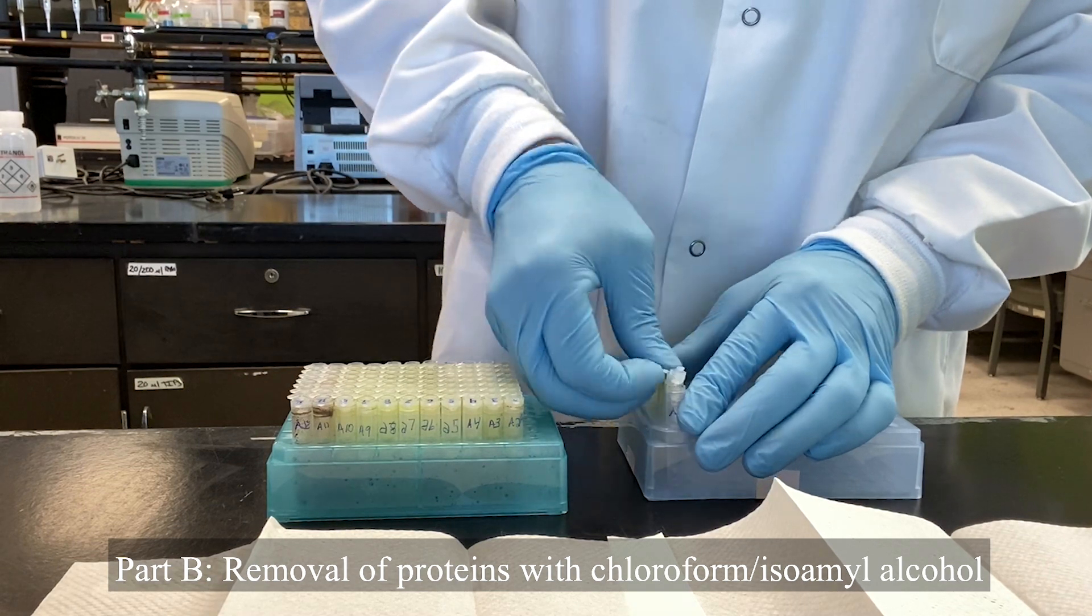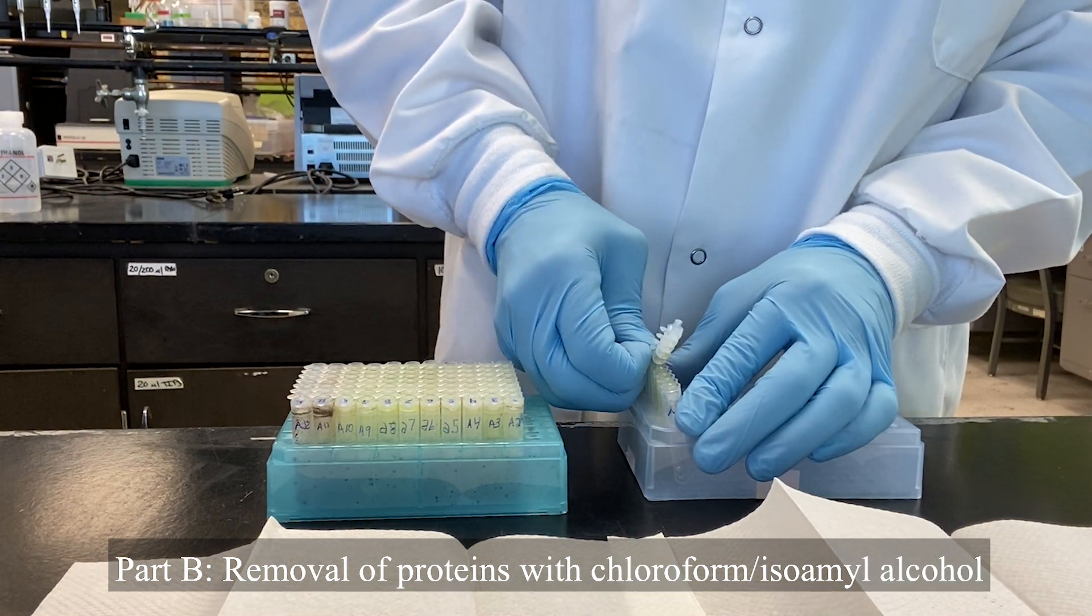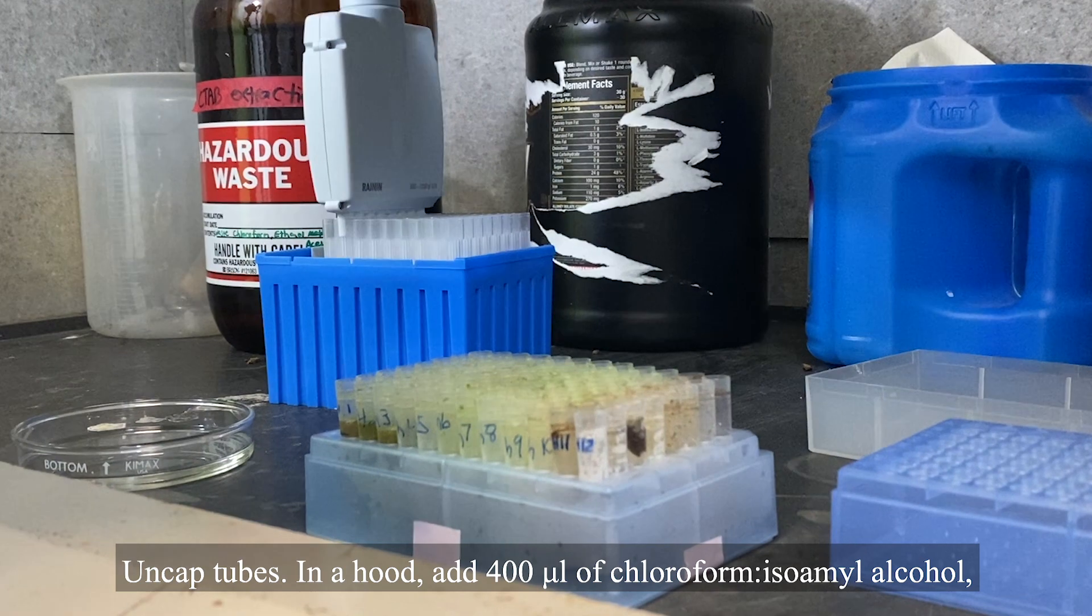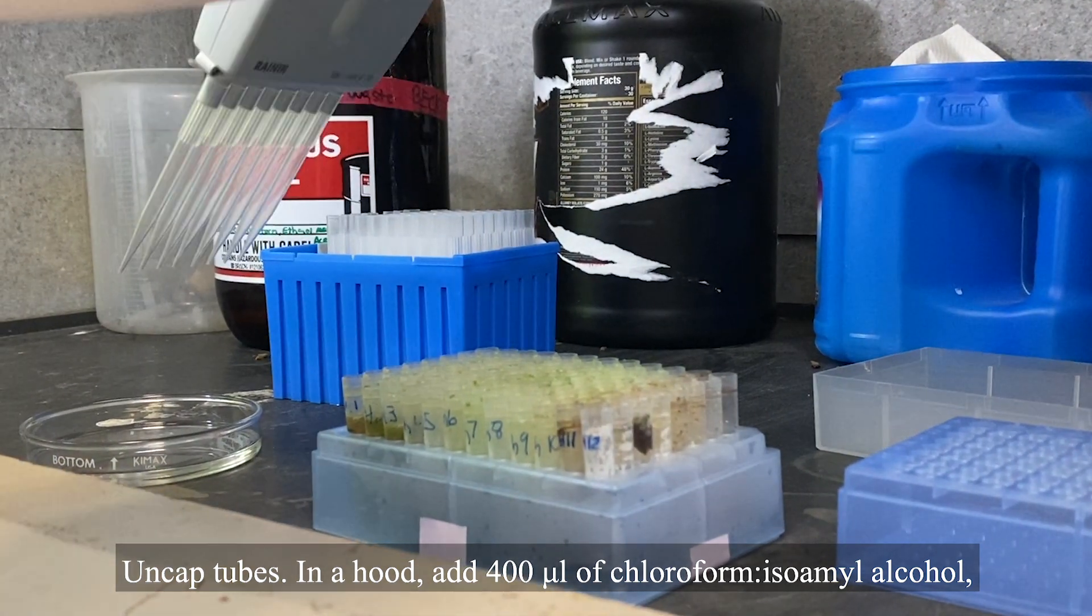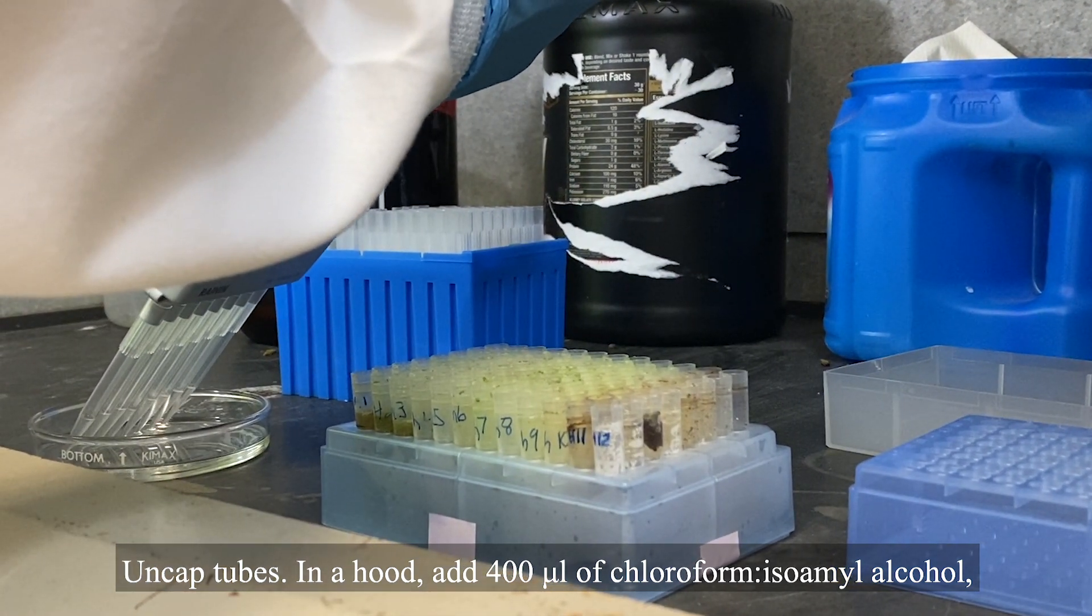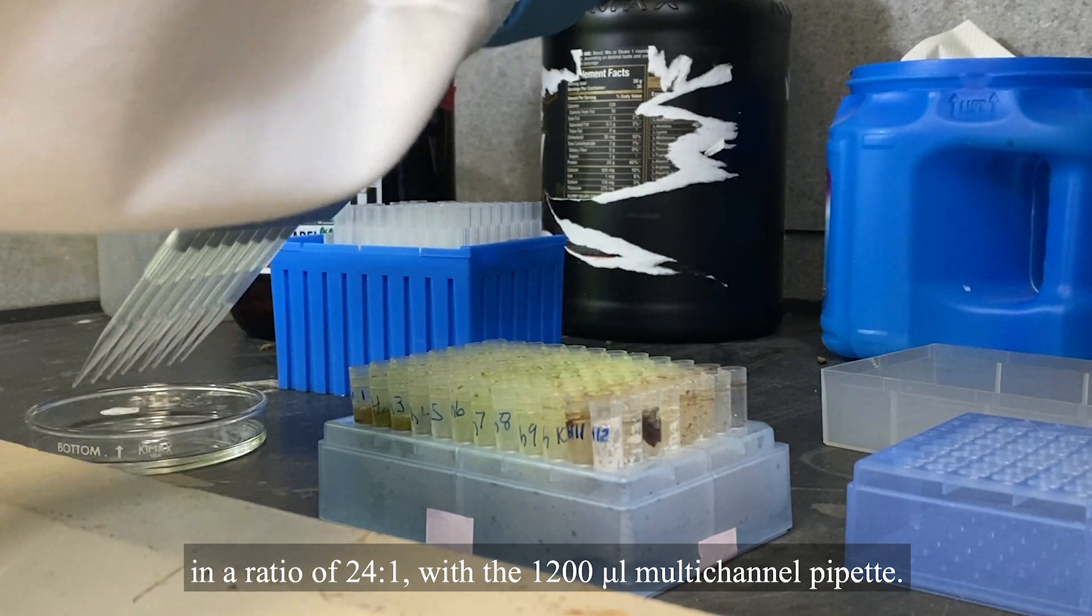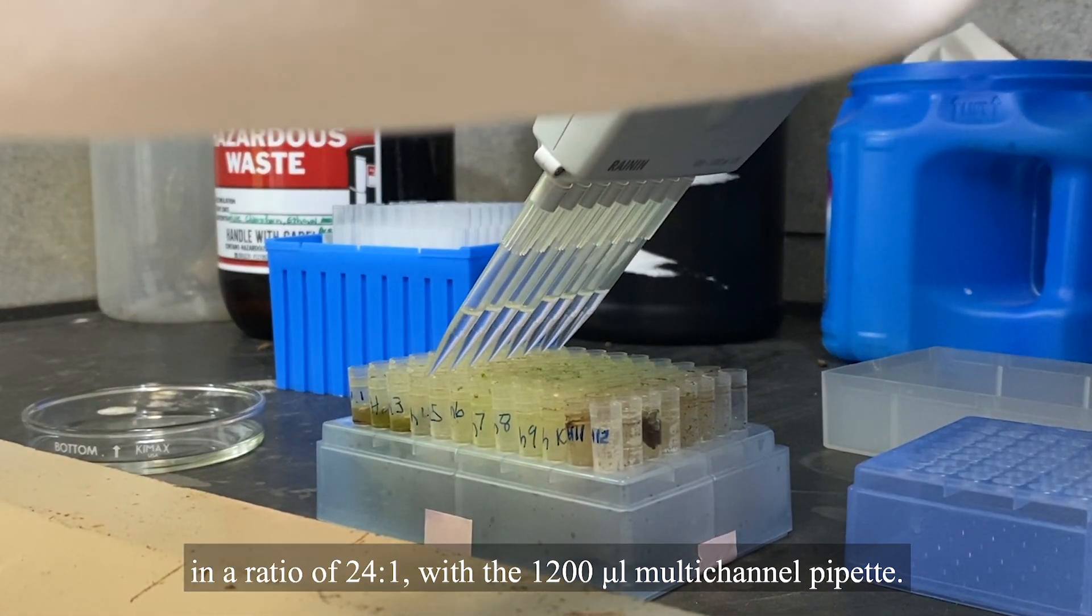Part B, removal of proteins with chloroform isoamyl alcohol. Uncapped tubes. In a hood, add 400 microliters of chloroform isoamyl alcohol in a ratio of 24 to 1 with the 1200 microliter multi-channel pipette.